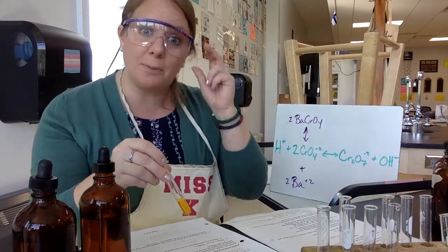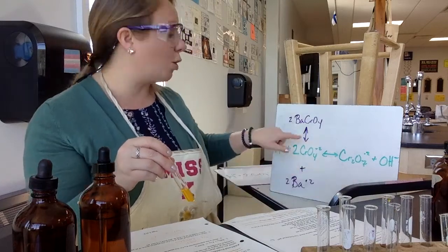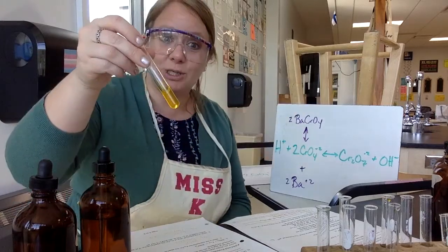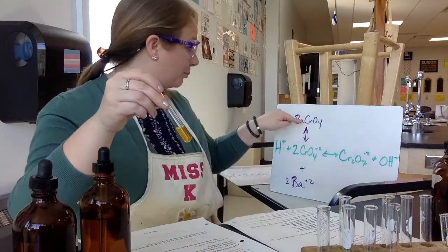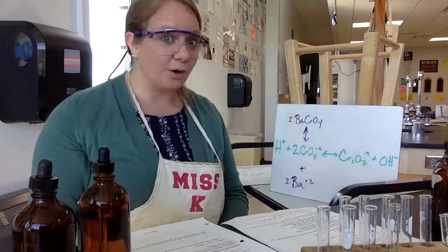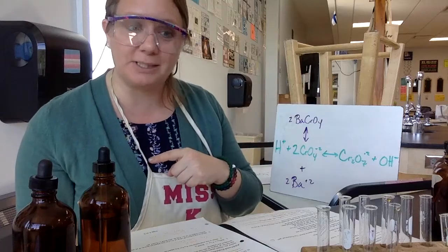So the two parts of number 9 to explain it: added reactant, so it shifted to product. You took away from the downside, so it had to shift down, and that's why we don't have a precipitate anymore, because the precipitate is up here. All right, excellent. So now we're going to screw it up one more time. Oh, actually, there's one follow-up question before we do step 10.